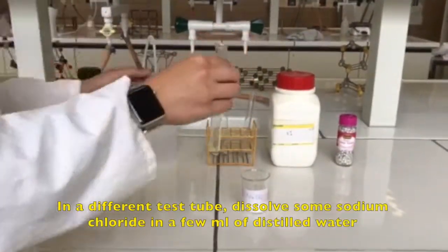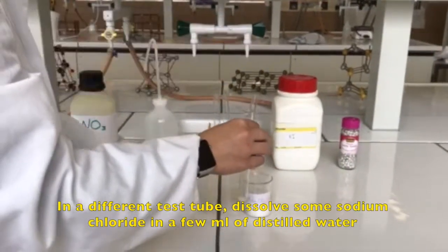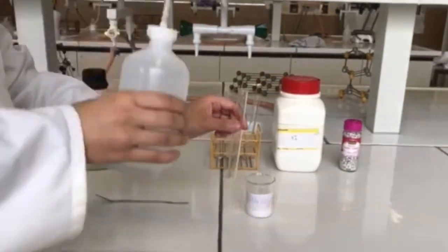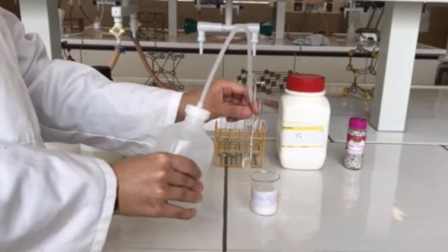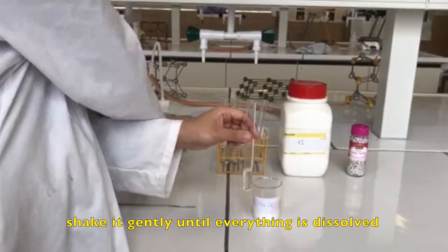In a different test tube, dissolve some sodium chloride in a few milliliters of distilled water. Shake it gently until everything is dissolved.